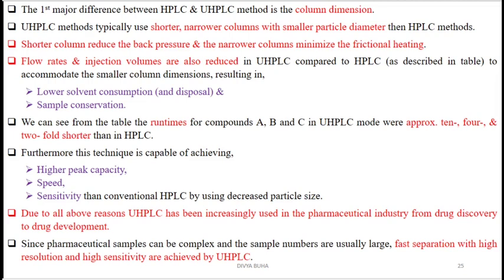So sometimes, even if the mobile phase is being passed through the column at higher pressure, there would be an issue of the backfiring of the mobile phase. Why? Because it is difficult for the sample, or you can say the mobile phase, to pass through the small size stationary phase particles, right? So there would be an issue of the back pressure. Okay, the mobile phase which consists of the sample might be thrown back, right, in the reverse direction.